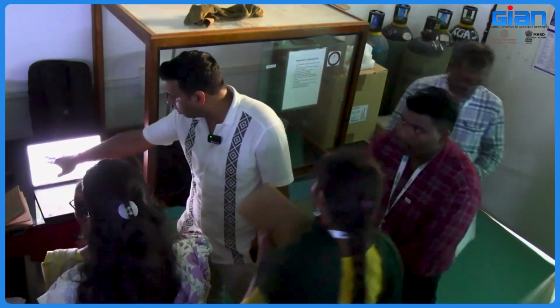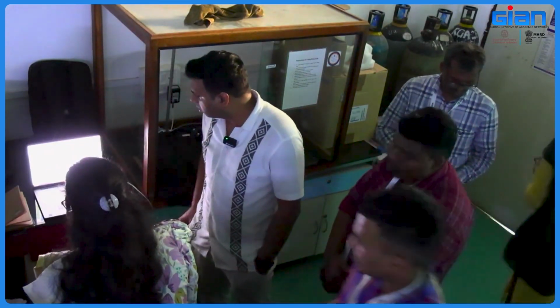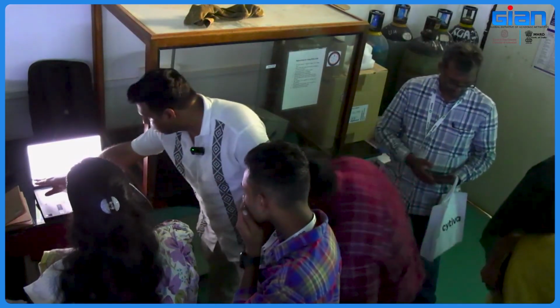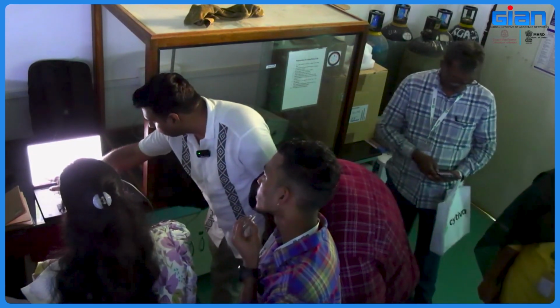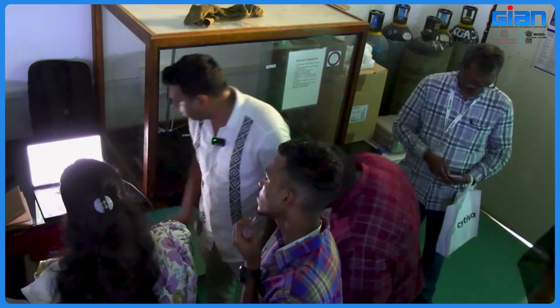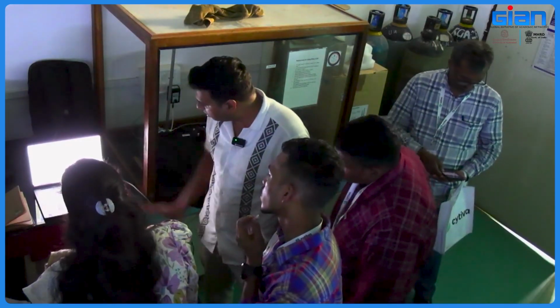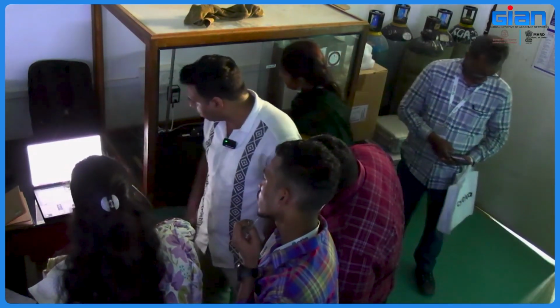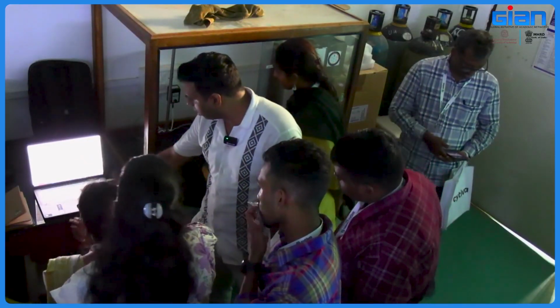It's already selected, right? So DR is already selected. You just go to measuring light, then balance it here. Okay, then it's on. Go to light curve. Zero there somewhere, that's fine. It's in range. Go to light curve, then click start. Okay, done. It's starting already.